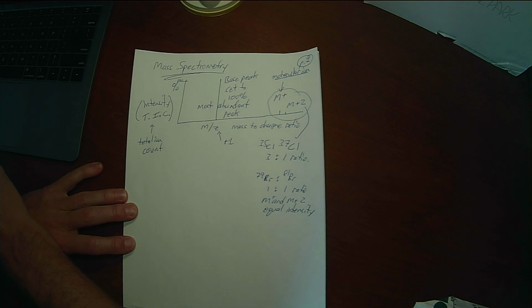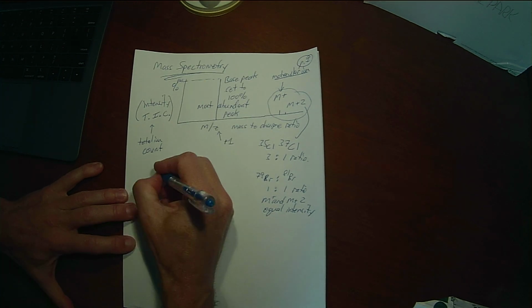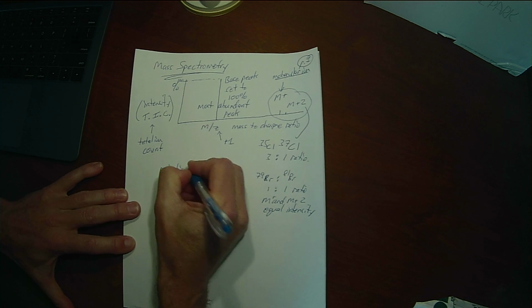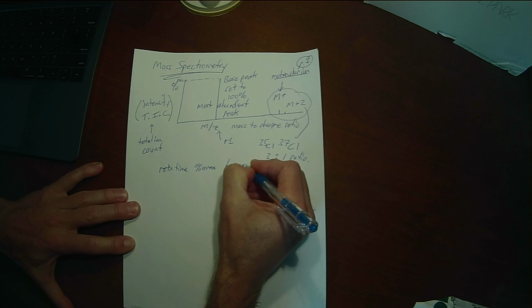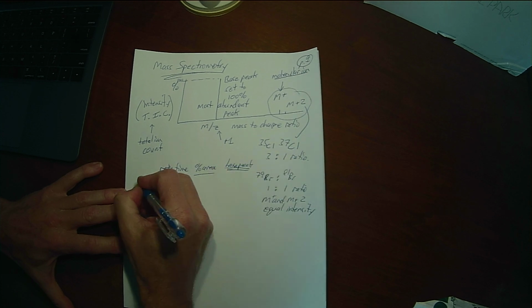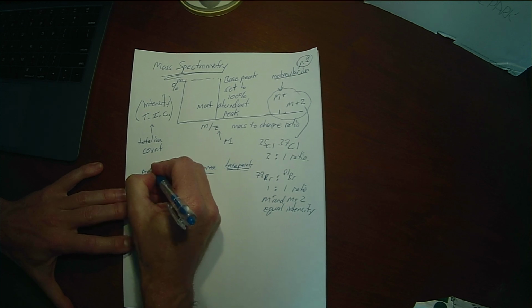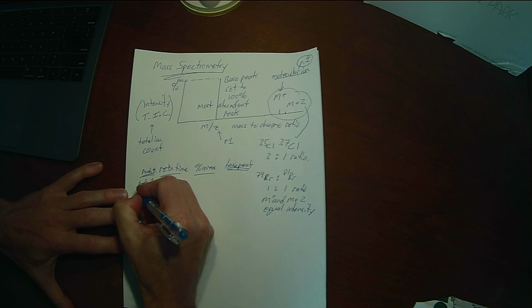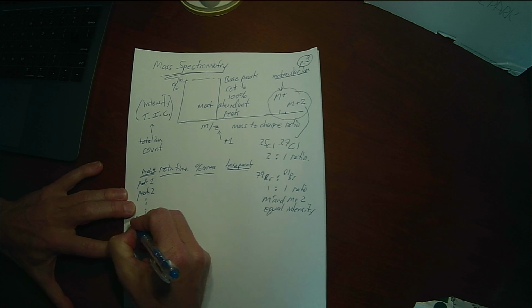So when you look at the numbers in parentheses, if you're looking at a mass spectrum from the literature, those numbers in parentheses are the percentage of the individual fragment relative to the base peak set equal to 100. So in the table, right, that you saw with retention times and percent area, that last column told you what the base peak was, right? So peak number, peak 1, 2, 3, and you had 7 peaks, right? Because we managed to separate 7 of the 8 isomers.